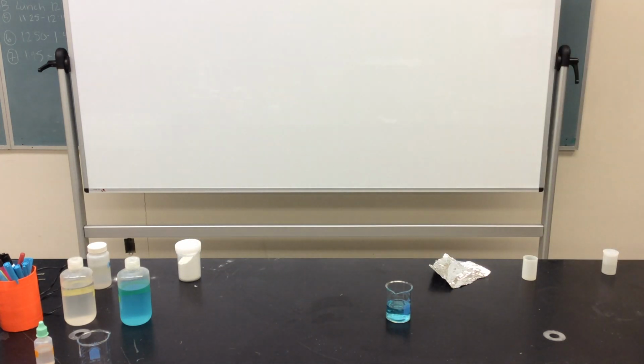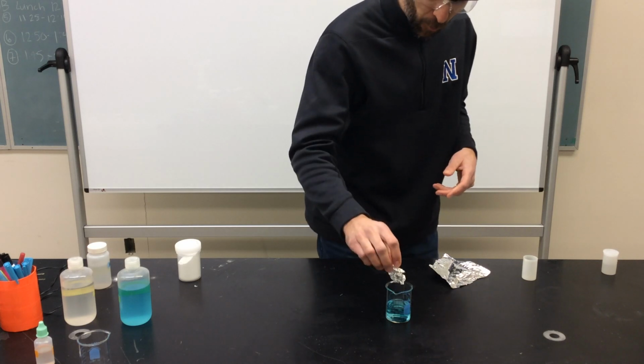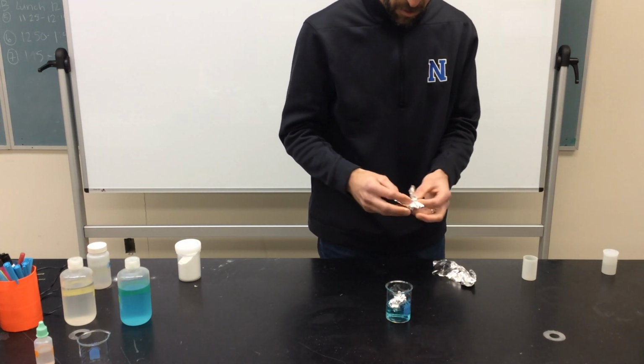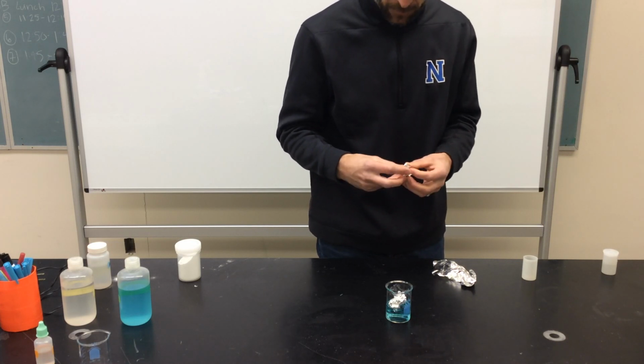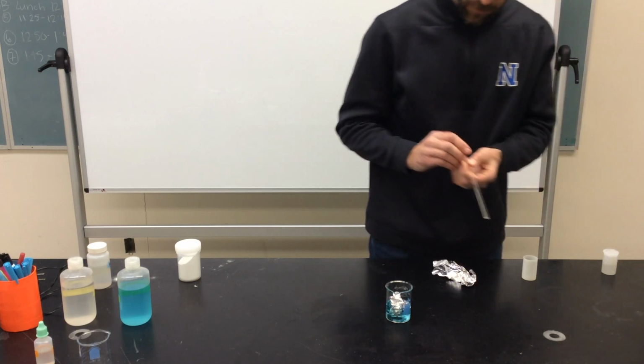Sorry, I should be wearing my safety glasses and demonstrate good lab technique here. So for this first experiment, we're going to put some aluminum foil into our copper chloride solution, and we're just going to make a few observations.